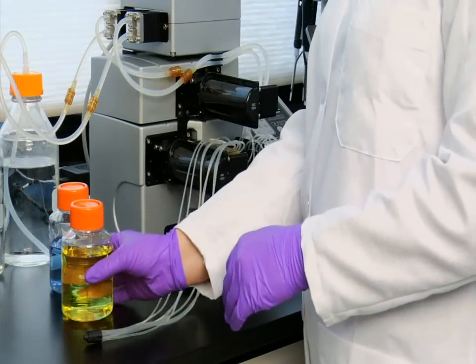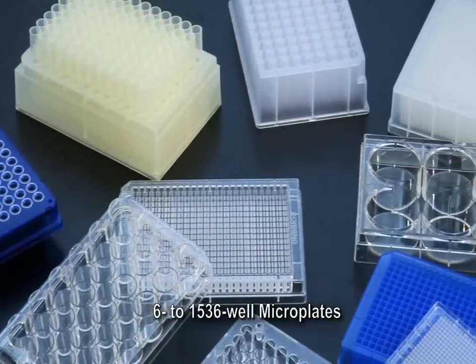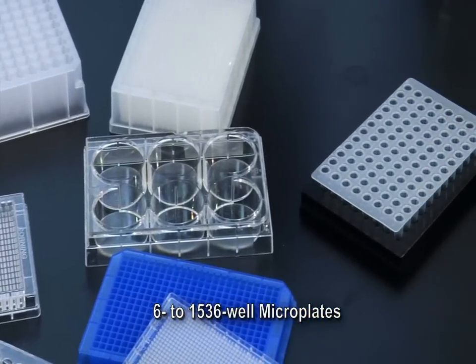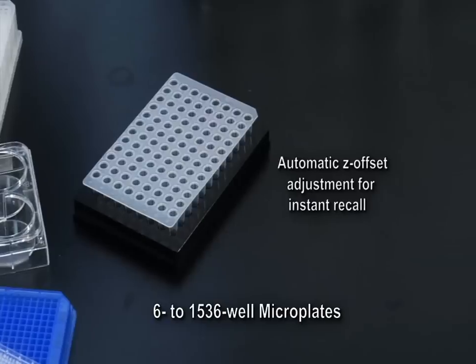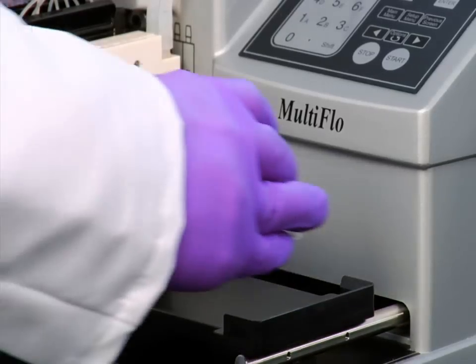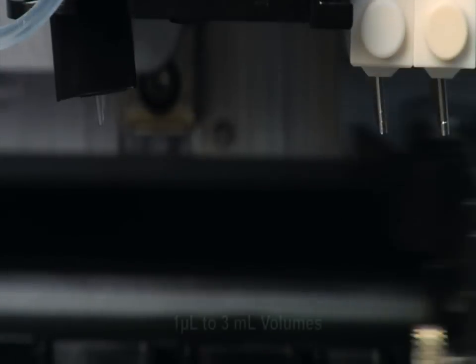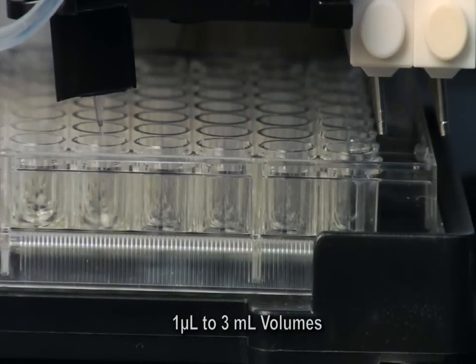The Multi-Flow is a 1 to 4 reagent all-in-one microplate dispenser designed to accommodate any plate type from 6 to 1536 well densities. Low profile, standard height, and deep well formats are all dispensed across a selection of heights up to 50 millimeters with automatic Z offset adjustment for instant recall. Volumes from 1 microliter to 3 milliliters are available in single microliter increments, with multiple flow rates from gentle to full force dispensing.